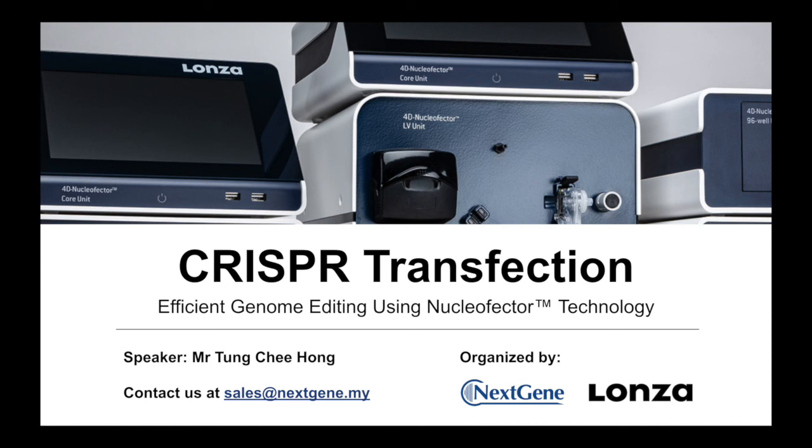But mostly for plants, as far as I know, the delivery of the guide RNA and Cas protein uses the standard transformation approach, which is Agrobacterium. So perhaps we have to look for tools for that delivery method. And luckily, we have the plasmid repository site. I'm not sure if you know about it, which is Addgene, which has proved to be a valuable tool for the scientific community. A lot of researchers deposit their plasmid DNA used for various applications, even for CRISPR, in the Addgene site.